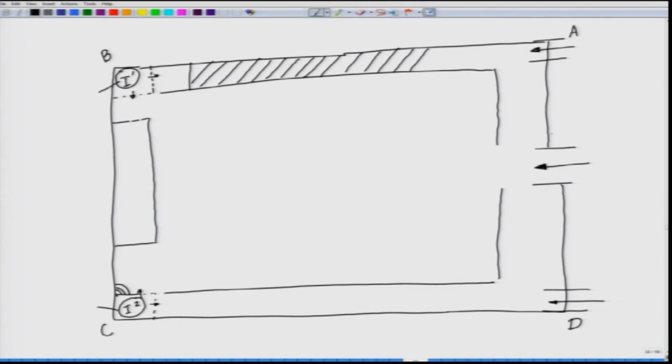Now, these are the places for the incubator, and just outside the door or somewhere out here you will have the place for the extra cylinders, which should be tied up or kept in proper frames so that they do not fall down. You also need a cylinder trolley to carry the cylinders inside and outside, and prefer to follow one track: take the cylinder to this spot, and do not mess up the center of the lab, the whole surface area.